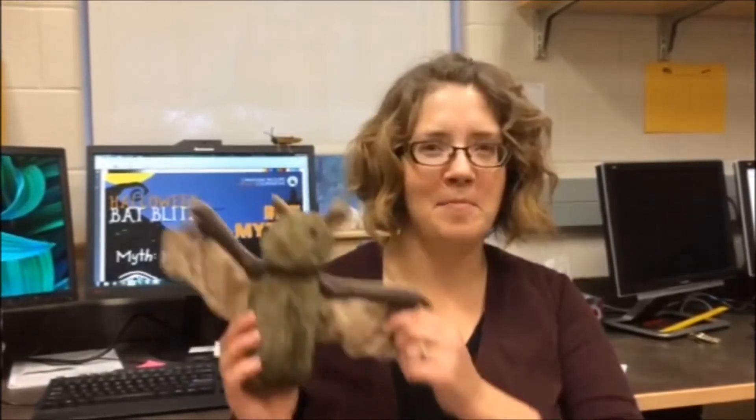Hi, I'm Marnie Zimmer with the Western Northern Region of the Canadian Wildlife Health Cooperative and today we're going to talk about bats and what happens when a bat comes into our lab for necropsy. We get roughly 40 to 50 bats each year that come into our lab for necropsy and we normally test them for white-nose syndrome, rabies and other diseases that bats can get.